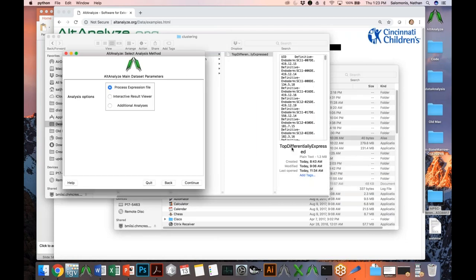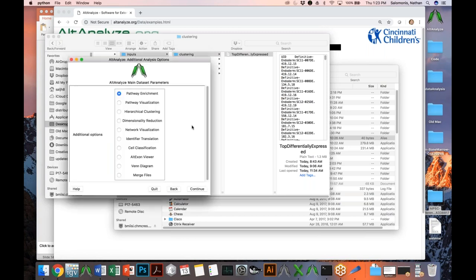If you now say continue, the program prompts you to either analyze an expression file — in which case you might perform differential expression or unsupervised analyses for single cell RNA-seq — or open an interactive results viewer to navigate previously generated results. What we're going to be doing is going to 'Additional Analyses' options. These are some of the most powerful options in the program, and you can use them independent of having FASTQ, BAM, or 10x genomic input files — you can analyze data from simple text files already generated from whatever analysis pipeline you have.